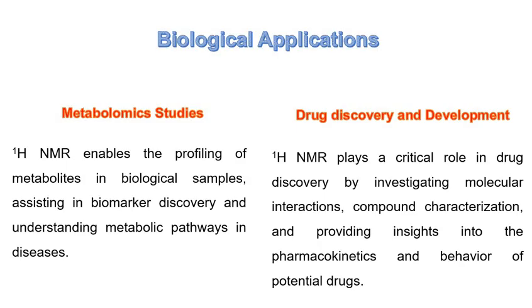Helps to study drug-target interactions through chemical shift changes. It supports metabolite profiling in pharmacokinetics and metabolism studies. It assists in formulation analysis and stability testing of drug candidates. It enables non-destructive, reproducible analysis throughout the drug development pipeline.